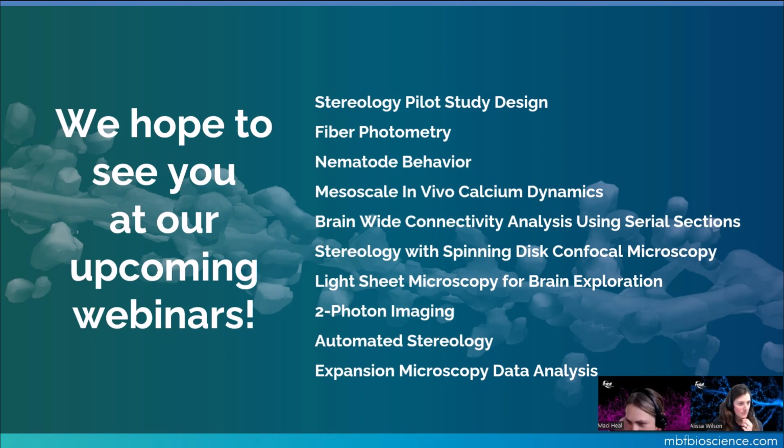There was a question about other analysis software failing to detect large vessels whose walls are labeled and not the lumen. That's one of the reasons why we produced the vessel filter, to address that specific challenge where you have difficulty targeting the vessels because they're not solidly filled. That vessel filter in the batch pipeline has been really helpful in those scenarios.